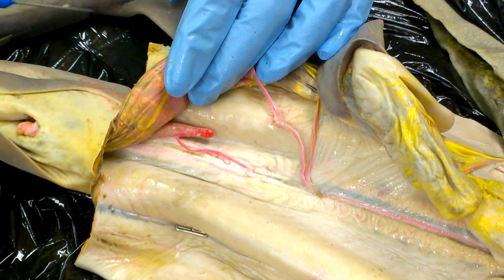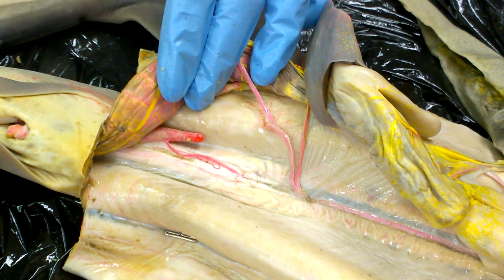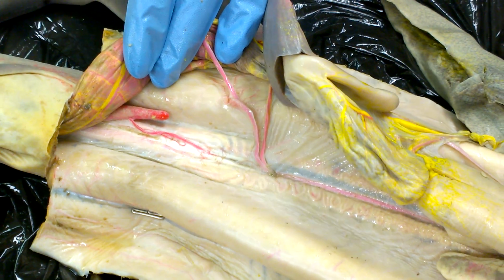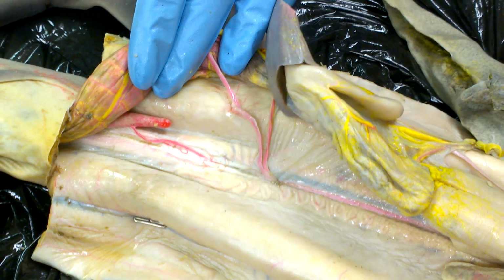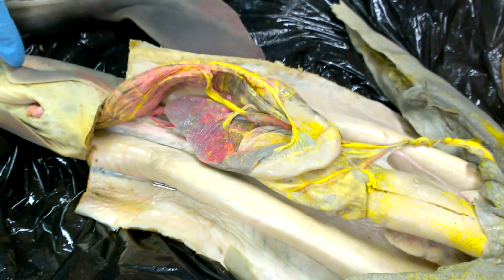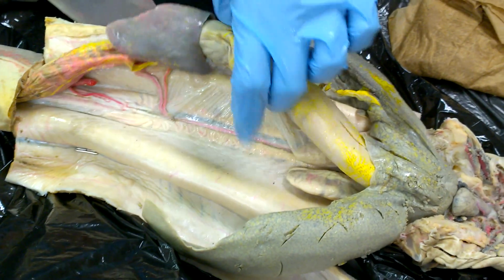So the rectal gland specifically does sodium chloride balance between the shark's blood and the ocean water. Okay. So the kidney does all sorts of other salt and waste balance, but the rectal gland specifically does sodium chloride, to make sure that this shark matches the ocean water. Okay, so that's all of the blood out. All the blood out that we're going to learn comes as some kind of branch off of the dorsal aorta.